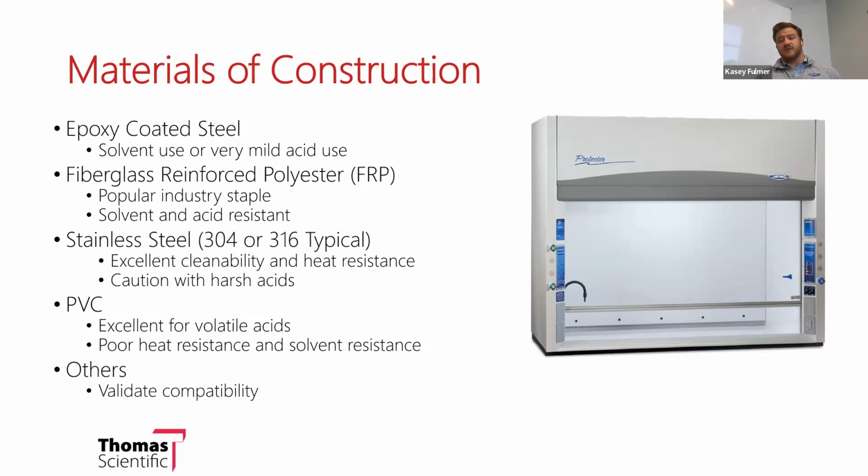And obviously, these are only a few of many materials. I know that there are many out there. These are by far the most common materials that you'll see. So knowing these gets you in a great position to make sure that your hood is set up and built to last with whatever you're handling, whatever your processes are inside of it.